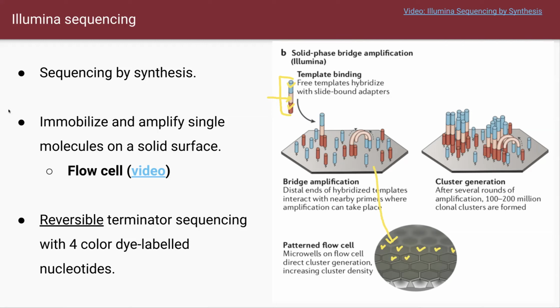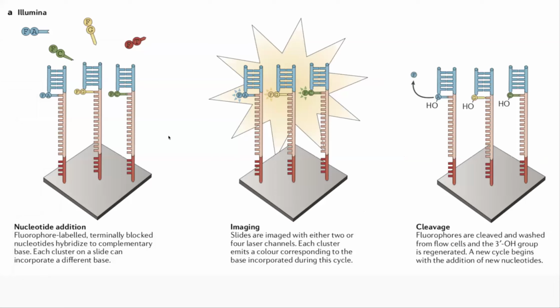So once you get that information, you go through the synthesis for your sequencing. For that purpose, you have to use a fluorescent dye. Then that information can tell you which nucleotides bind to certain data points. So in Illumina sequencing, once you get the library bound to the priming station, then you use another primer complementary to the other adapter here. Then you attach each nucleotide onto here.